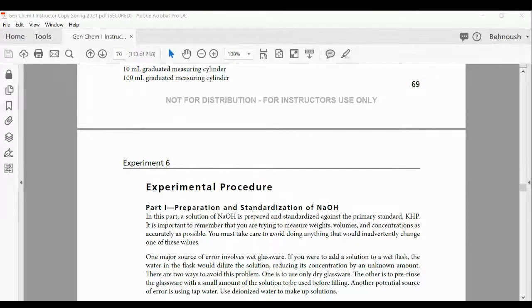But you cannot use sodium hydroxide to take care of an upset stomach, because sodium hydroxide is a very strong base and is going to burn all the tissues before it gets to the stomach. So antacids are very weak bases. The reaction of an antacid in the titration is going to be very slow. You add a drop, you think it is neutralized, and then after 10-15 seconds the color goes away. Then you add another drop, so it's a very slow reaction.